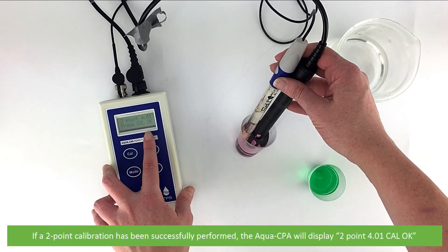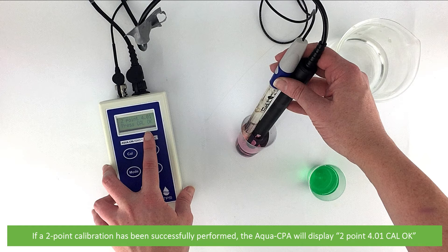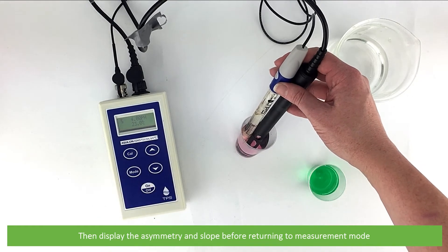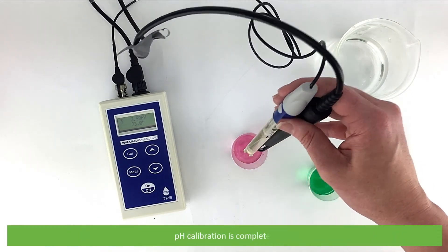Once the two-point calibration has been successfully performed, the Aqua CPA will display 2.4.01 CAL OK. Then it will display the asymmetry and slope before returning to measurement mode. pH calibration is complete.